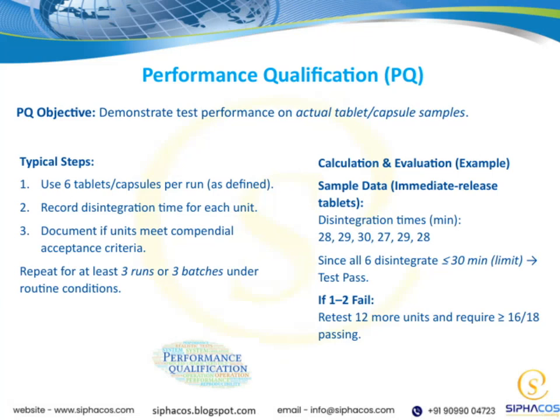Now, let's look at the objective of the performance qualification, or PQ, which is to demonstrate how the test performs on actual tablet or capsule samples. In this example, we're focusing on disintegration testing for immediate release tablets.